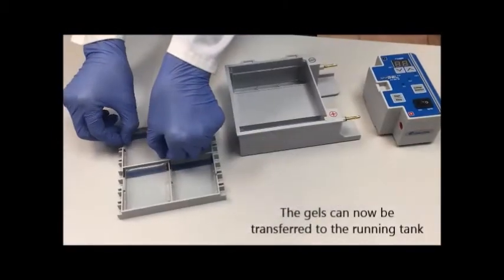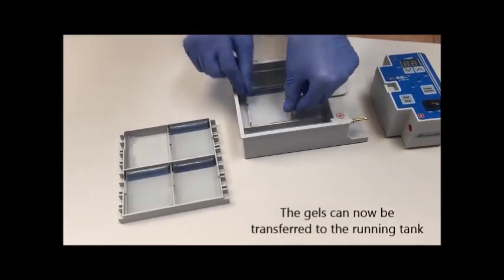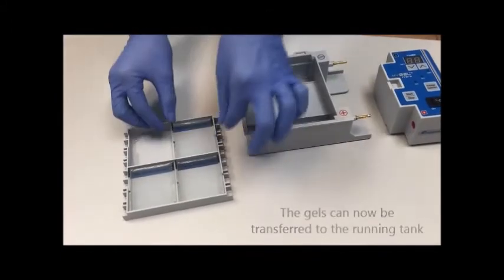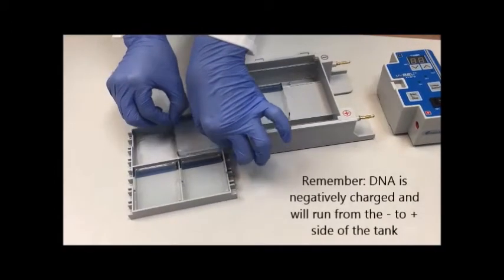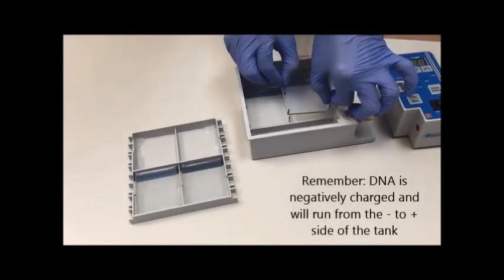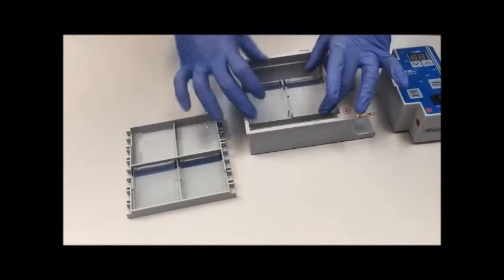The gels can now be transferred to the running tank. Remember to put the gels in the right orientation. The DNA will be running from the negative side to the positive side of the tank.